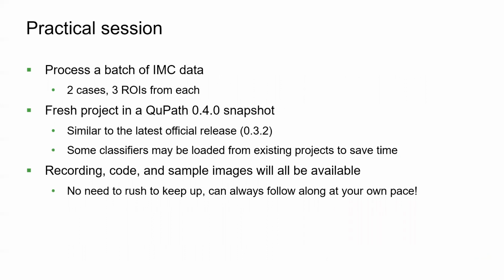So now I'll quickly turn over to the practical session where I will essentially demonstrate how I would go about analyzing this data. At the time of the conference, I'll be making publicly available a subset of our IMC data consisting of anonymized samples from 2 cases, 3 regions of interest from each of them. I'll also be showing, well, as the name suggests, an end-to-end workflow.